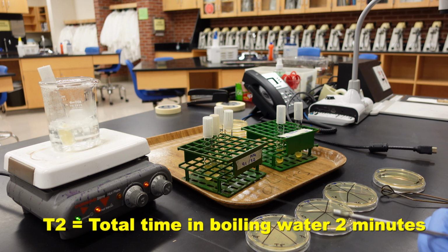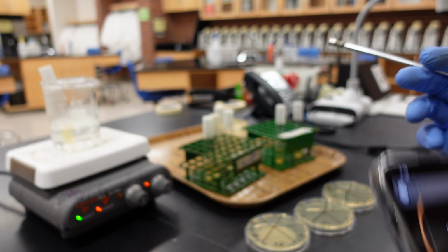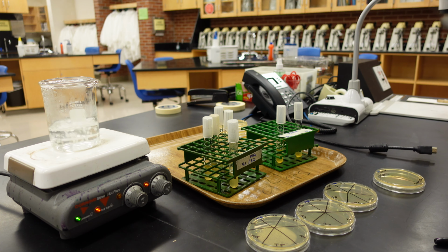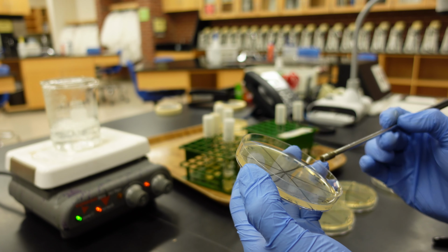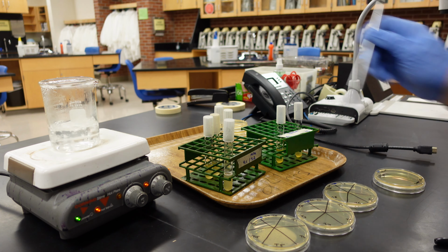I'm going to repeat this at 5 minutes and at 15 minutes and at 20 minutes. So it's a little bit different than what's written in your lab manual. And I will repeat that for all of the samples. We will see what will happen with E. coli. So that's 2 minutes for Bacillus cereus. And I'll place that back in the boiling water.